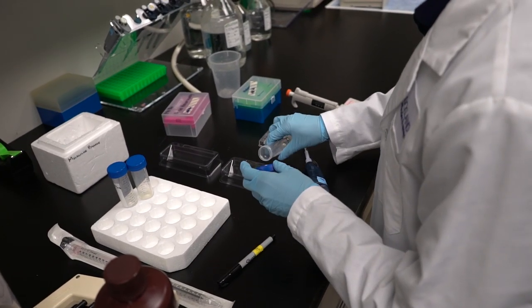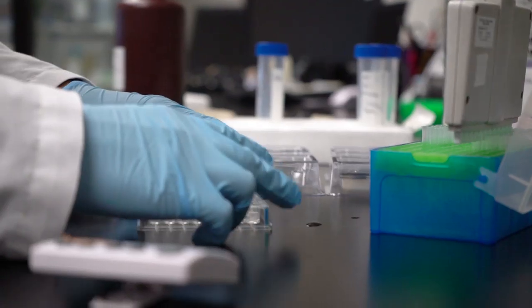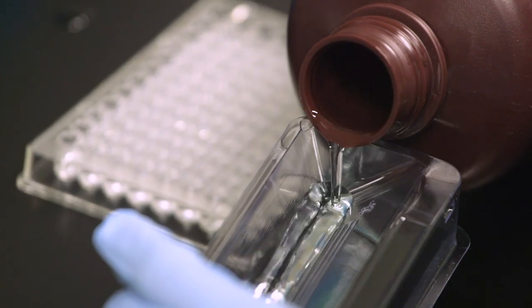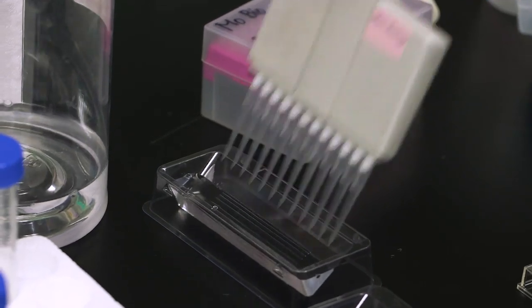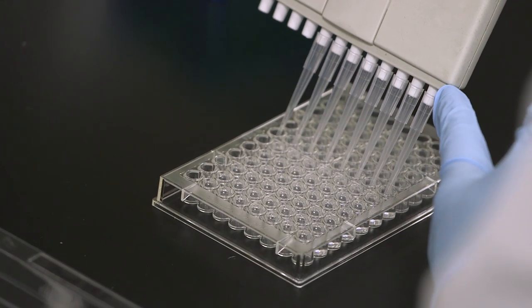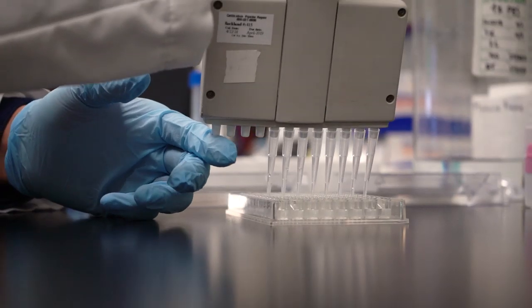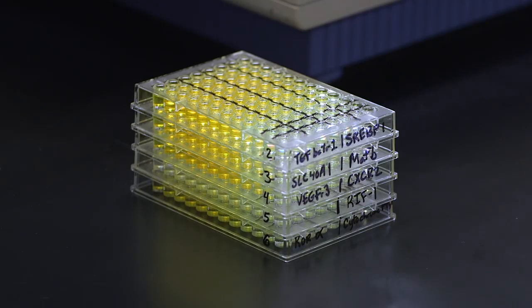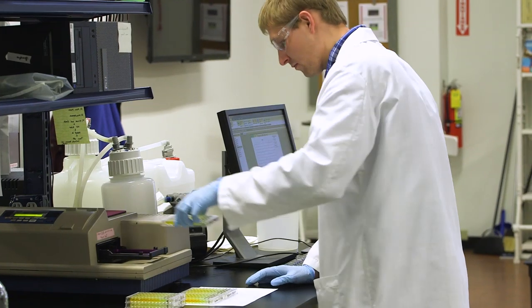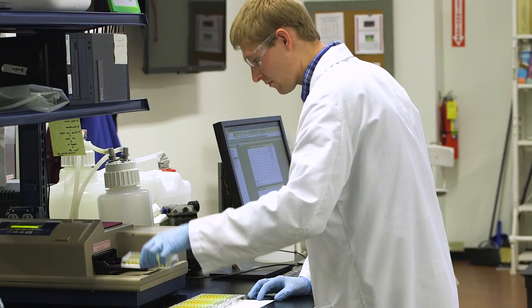Our cell culture capabilities include the generation of hybridoma cell lines for the production of monoclonal antibodies, but it also includes the maintenance of a fairly large collection of human cell lines and mouse cell lines that we use for the validation of our antibodies by different immunoassays including western blot, immunoprecipitation, immunofluorescence and flow cytometry.